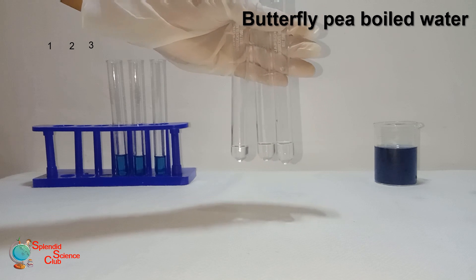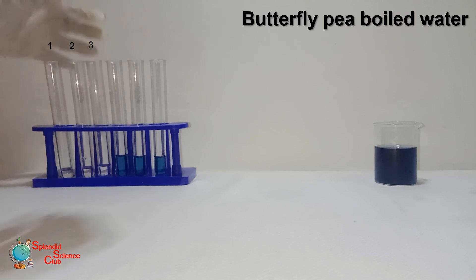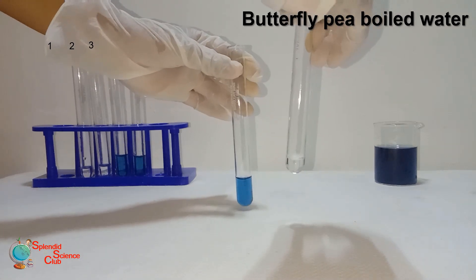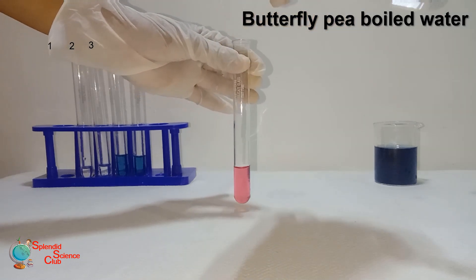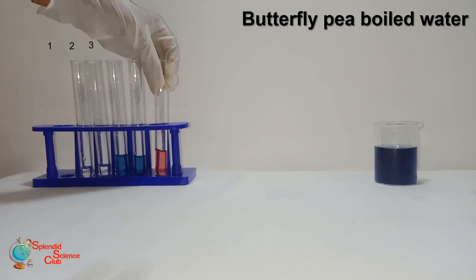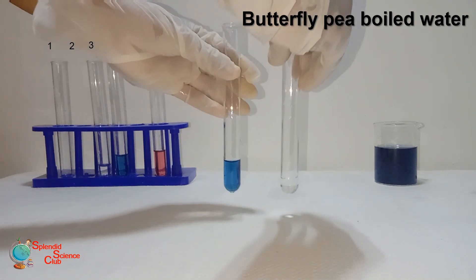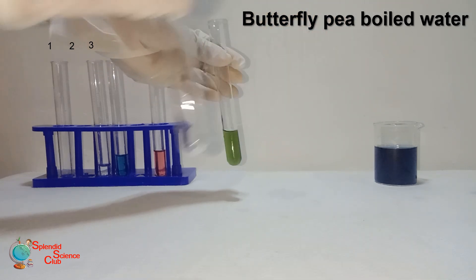These test tubes contain colorless liquids. Test tube one contains hydrochloric acid, two contains sodium hydroxide, and three contains water. We'll see the color changes. Did you notice? It turned into red. Then we'll add the chemical in tube two to the indicator — it turns into green.